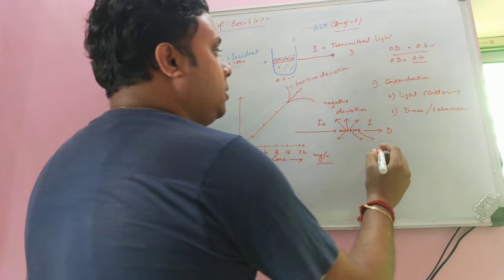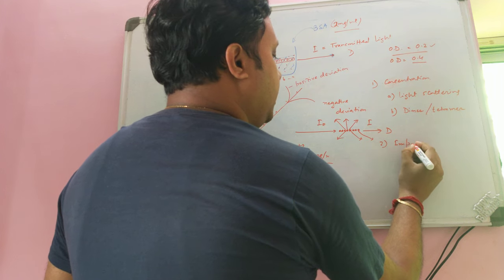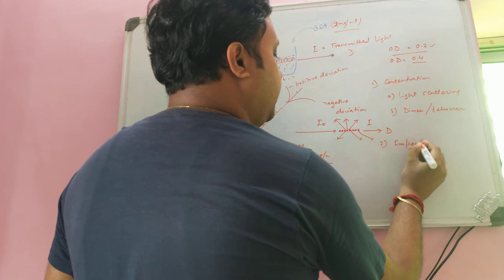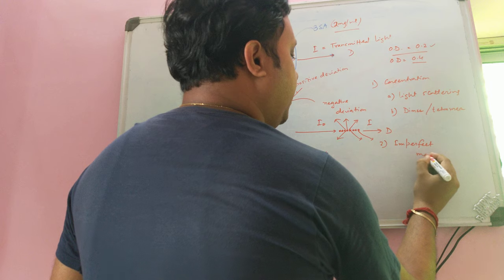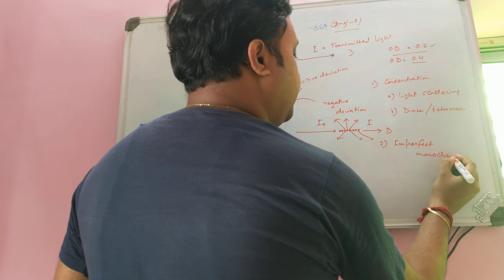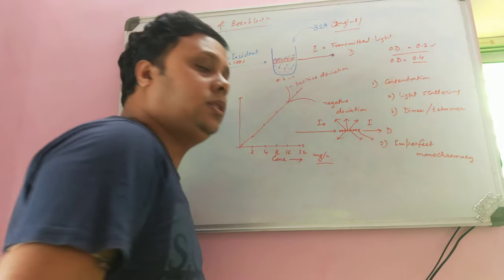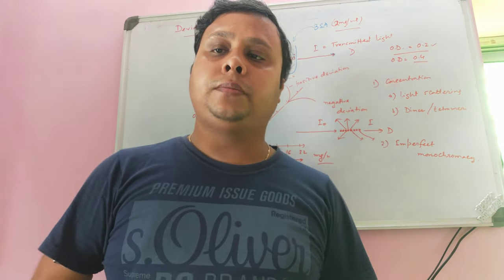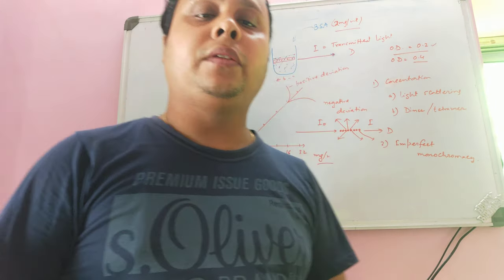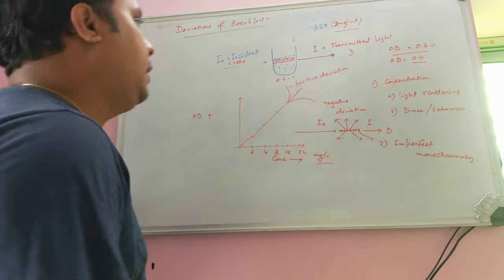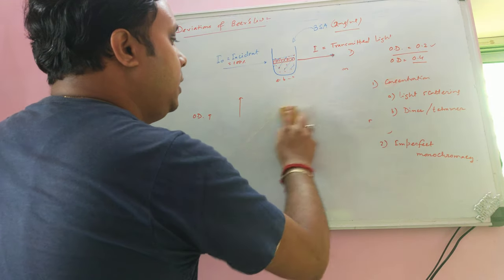The second deviation of Beer's Law is imperfect monochromacy. Beer's Law is applicable to monochromatic light only — meaning the incident light must be a single specific wavelength.